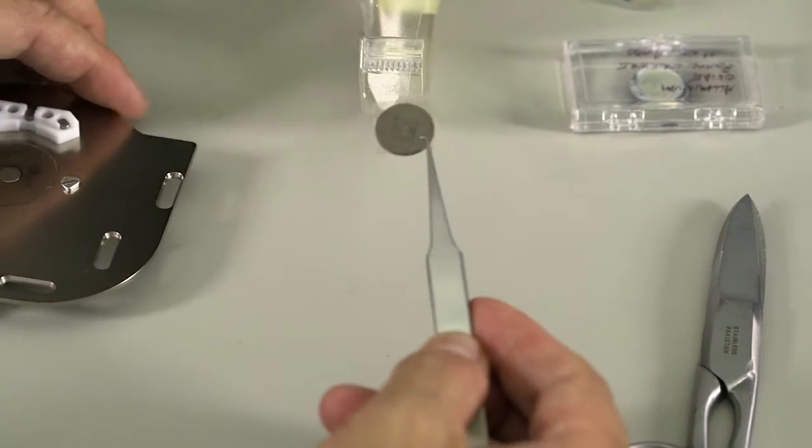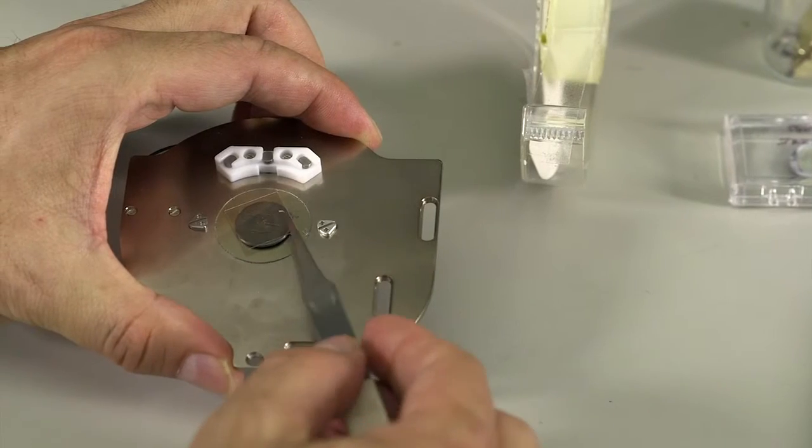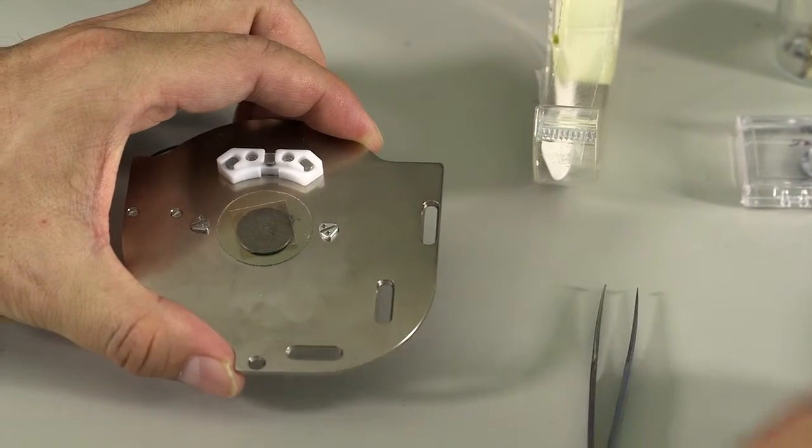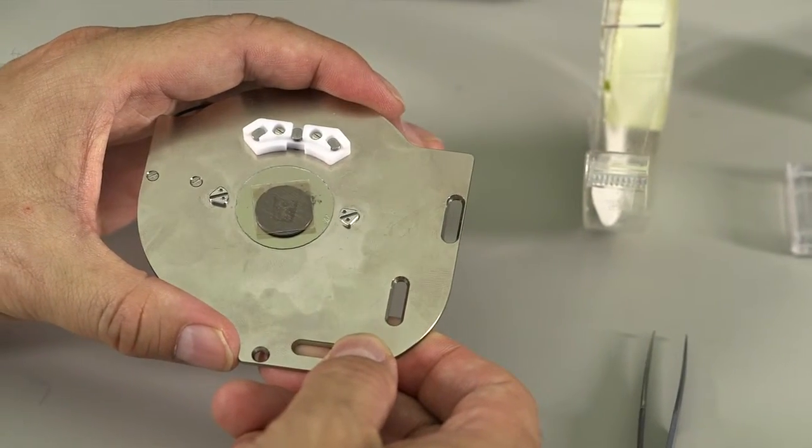Then you can pick up the steel dish with sample on it and drop on top of the sample plate. Now your sample is on the plate and ready for the next operation.